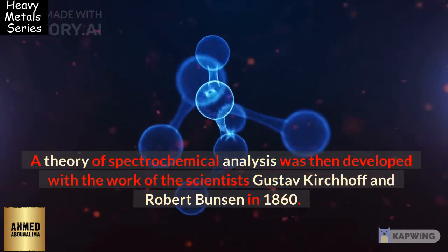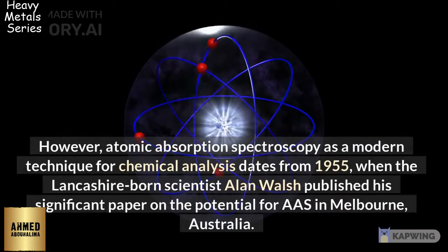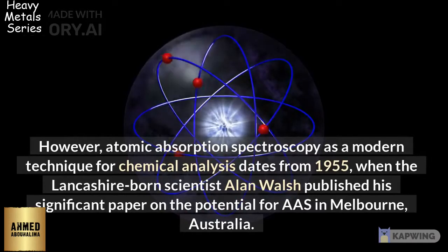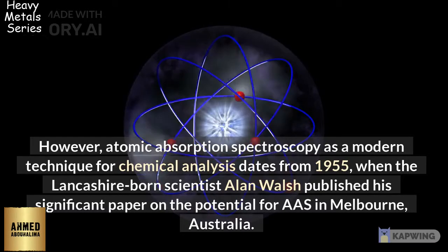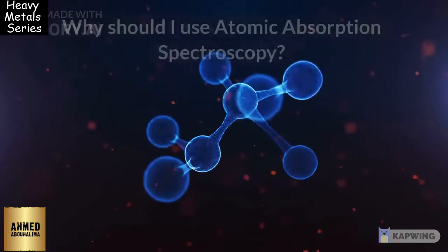in 1860. However, atomic absorption spectroscopy as a modern technique for chemical analysis dates from 1955, when the Lancashire-born scientist Alan Walsh published his significant paper on the potential for AAS in Melbourne, Australia.